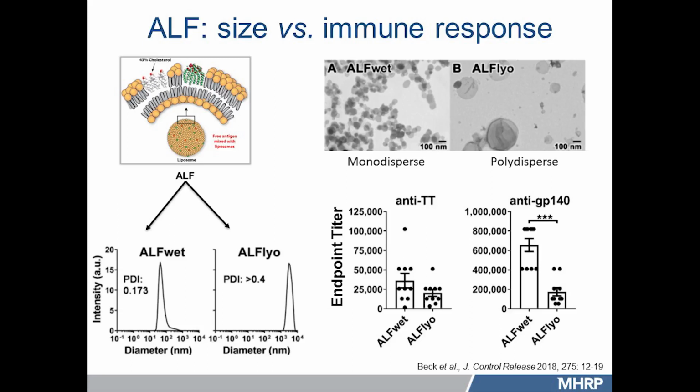So what to take out from this slide is that one size does not fit all. Depending on the antigen, the size distribution of the ALF formulation matters.